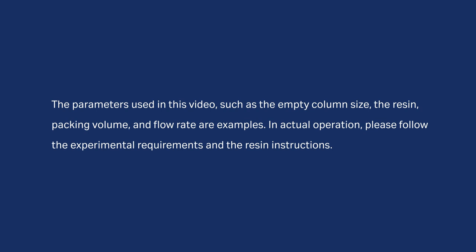The parameters used in this video, such as the size of the XK chromatography column, type of resin, packing volume, and flow rate are examples. In actual operation, please follow the experimental requirements and the resin instructions.